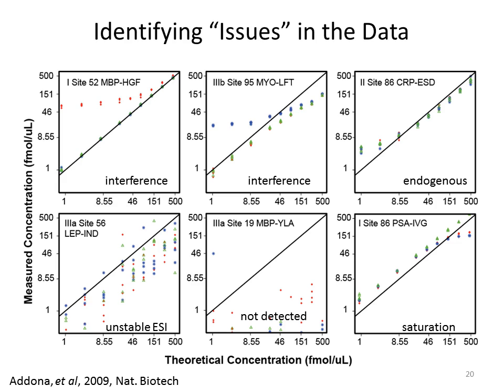Okay. Here's another example of an interference. Interferences tend to be easily recognizable because it's one transition that just peels away from the others. Because in a response curve, all the transitions should track together. But when you see one transition peeling away, then you know it's probably an interference from something else. Here, you see all 3 transitions flattening out.